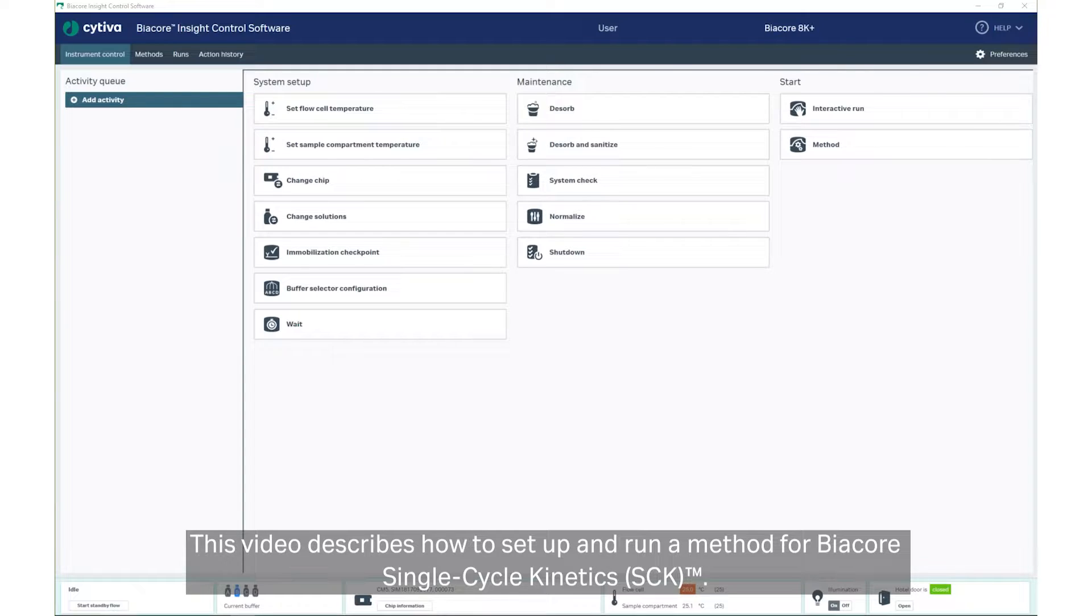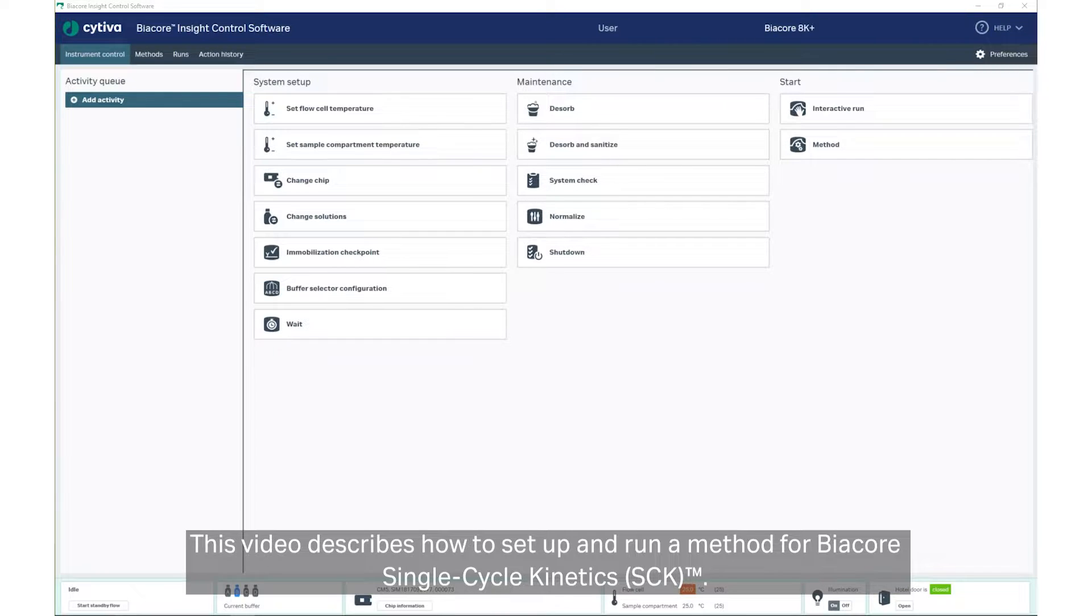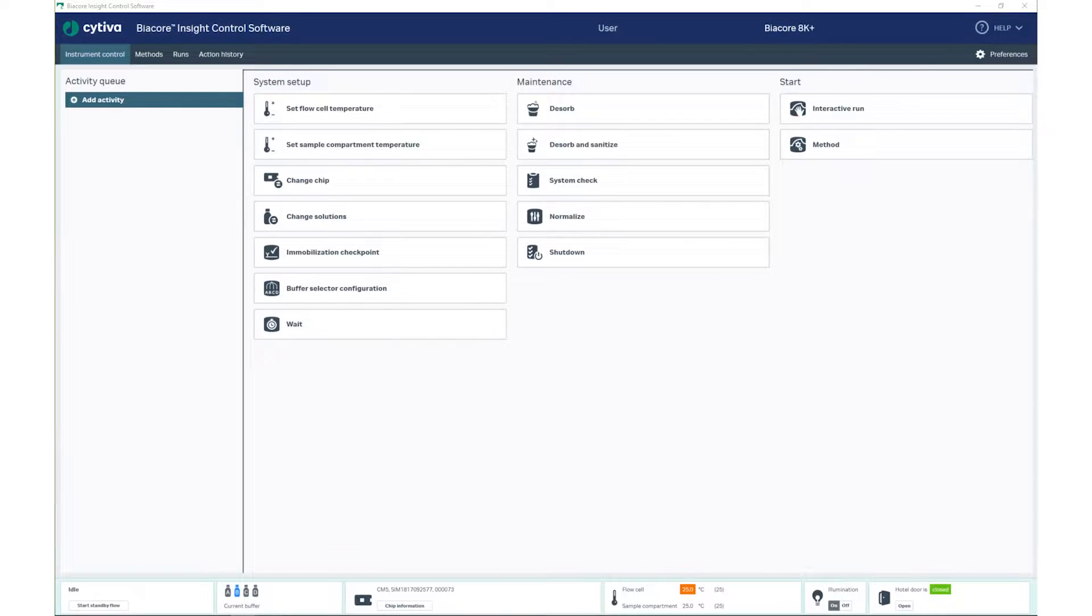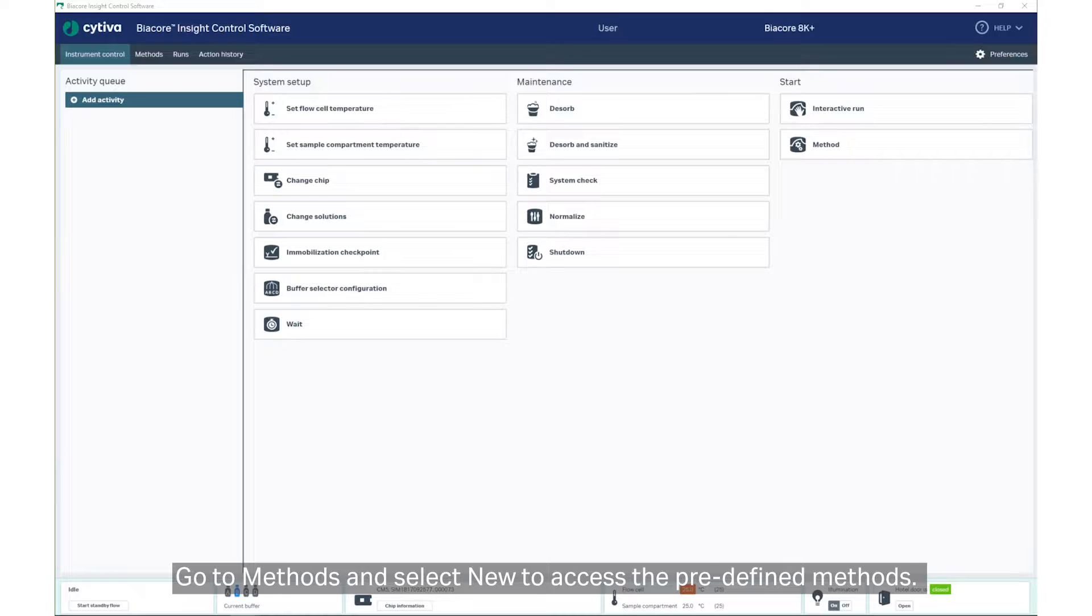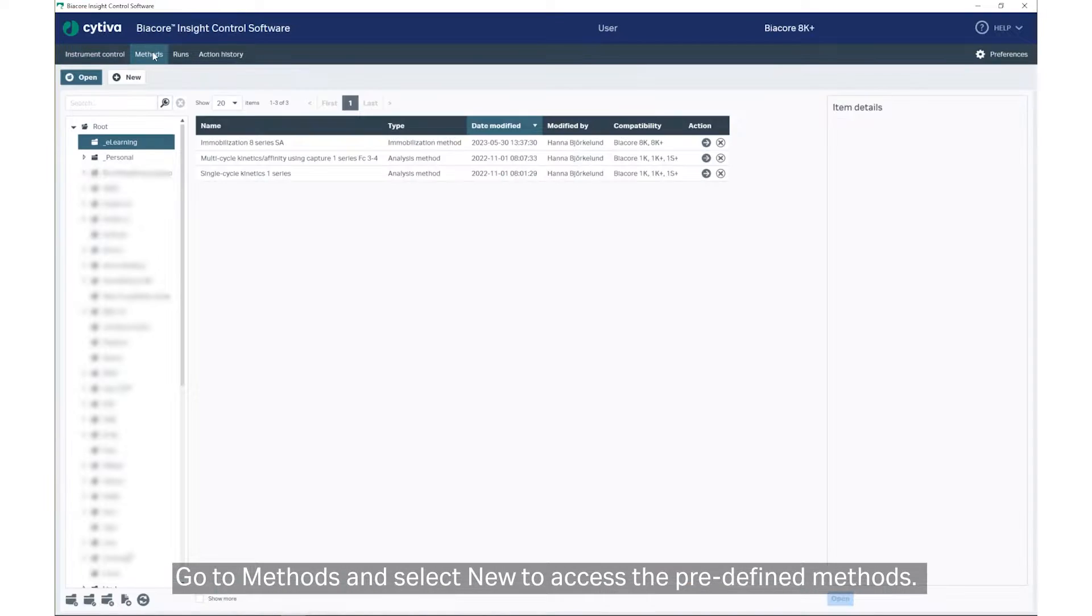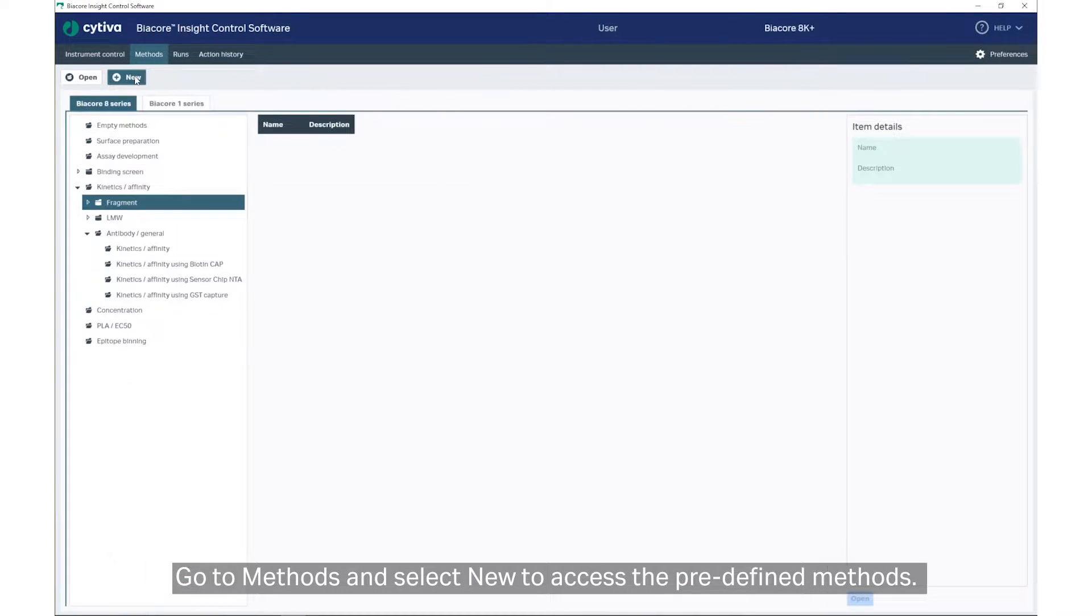This video describes how to set up and run a method for Biacore Single Cycle Kinetics. Go to Methods and select New to access the predefined methods.